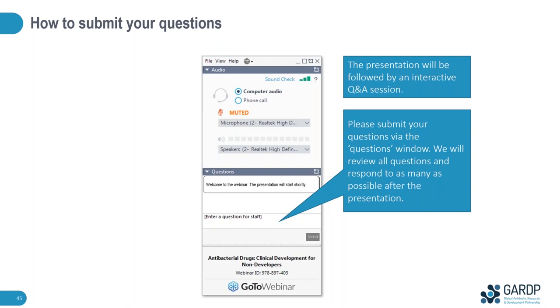Okay, thank you. We've now got another question, I guess a more detailed question on thigh infection models. The question is really, well, there's two parts to it, really. The first is, how about how you prepare the inoculum? Do you have any comments on using log phase versus stationary phase organisms when you infect? And also, how about infecting one thigh versus two thighs in the same animal? And if I can add a second question to that, if you do infect both thighs, how do you handle that data statistically?